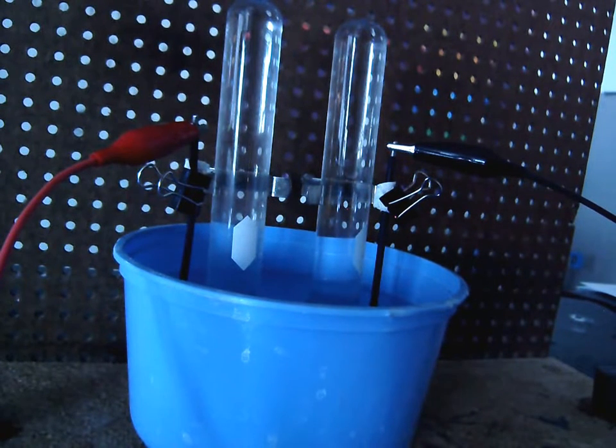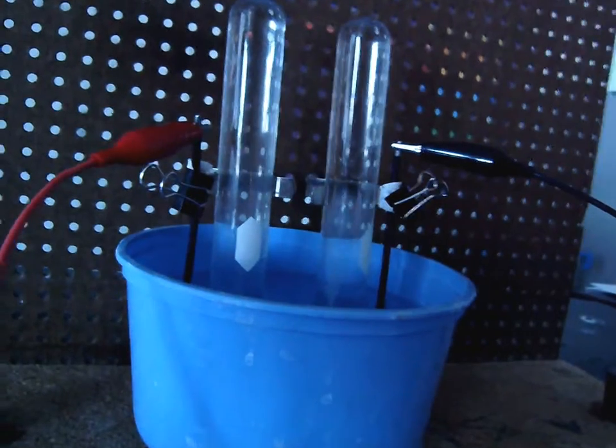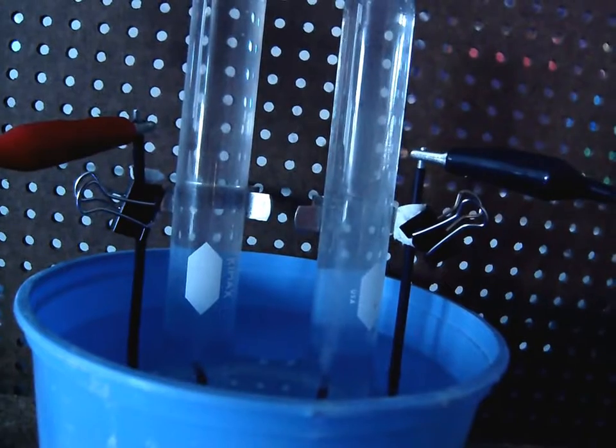So once we turn on the battery in a second, we're going to pass a little bit of electricity through the water, and then what's going to happen is it's going to break apart the hydrogen and the oxygen. Now, here's how this method works. Actually, I'm going to turn it on so you can start to see the process. So what you're seeing now is the gas that's being generated.